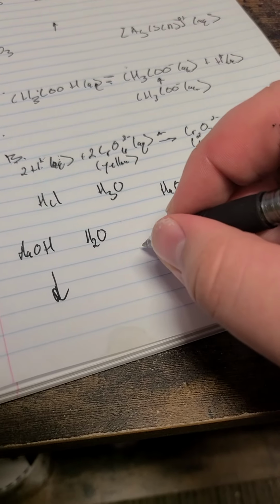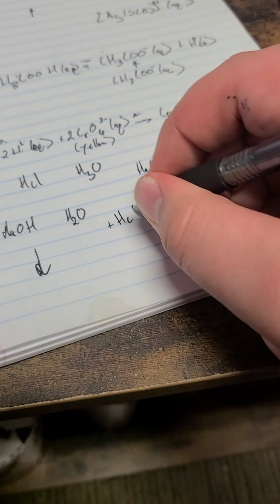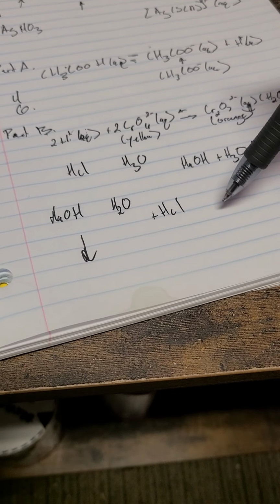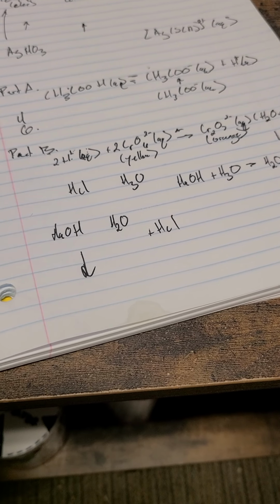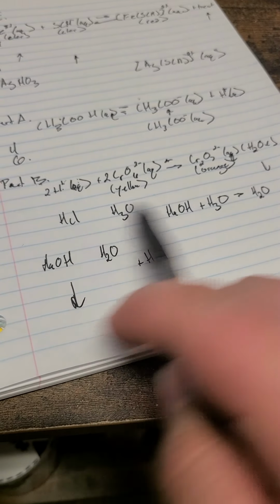Then when HCl is added again, it would work to cancel out the NaOH, as the NaOH cancelled out the HCl in the previous section. It would cause the color again to return to the original orange mixture seen in this reaction.